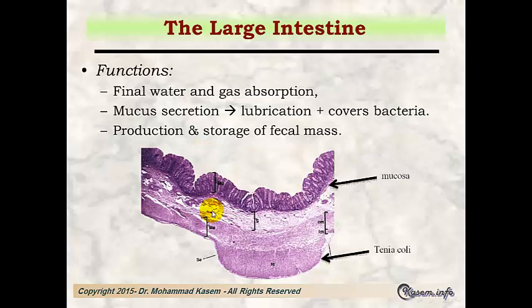See this small, low power magnification of the large intestine. The mucosa has no villi, as we just mentioned. The submucosa is just connective tissue.